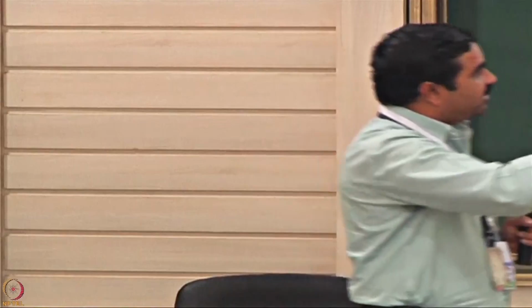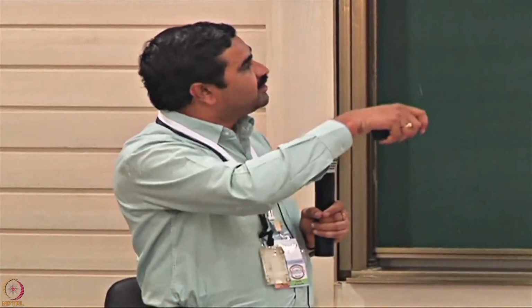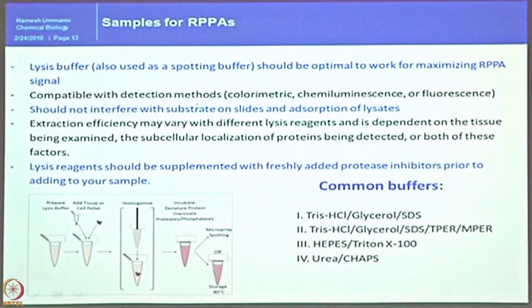With my experience, at least I worked with these 4 different buffers. Definitely these 4 different buffers behaved entirely differently with different samples. To believe that any one buffer will help is not true. In my hands, we had different experiences with different buffers, different tissues and different cell lines.